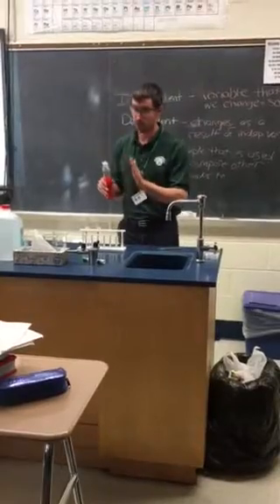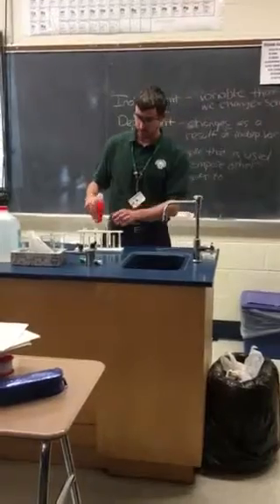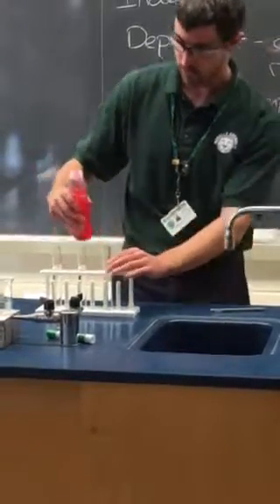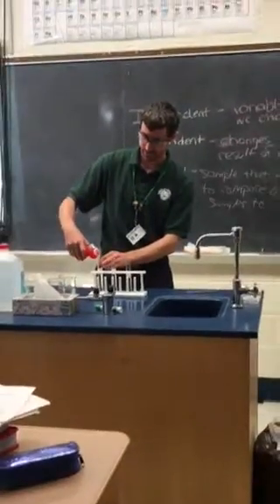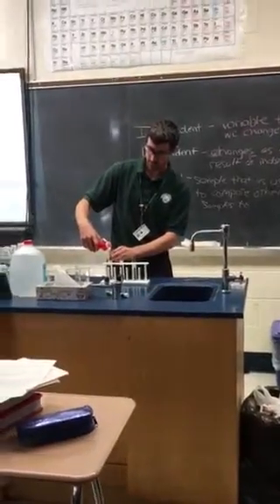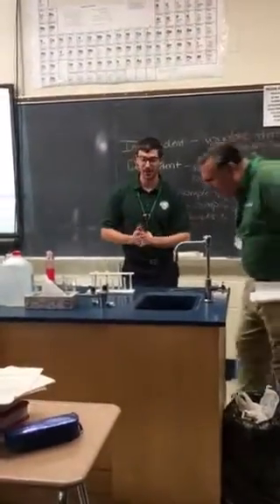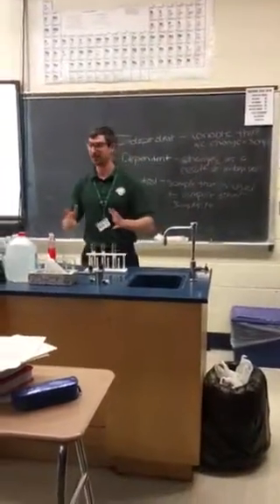Try to do the same. So if you're gonna do 2, do 2 for each. If you're gonna do 3, do 3 for each. And so you'll add, and you try to be precise. That's 1, 2, 1, 2, 1, 2.